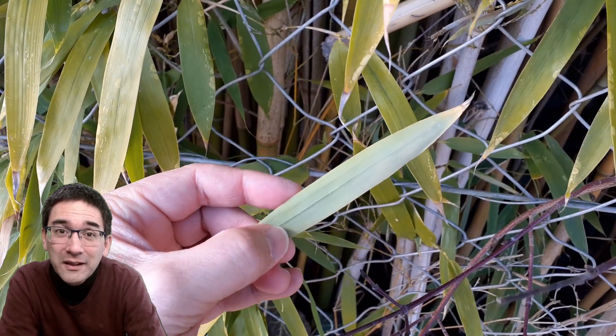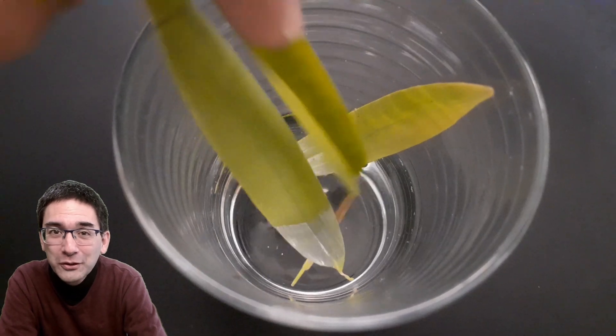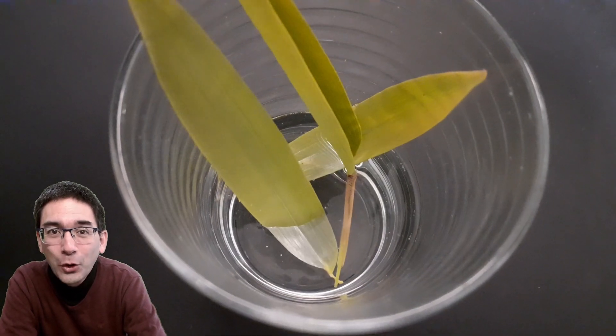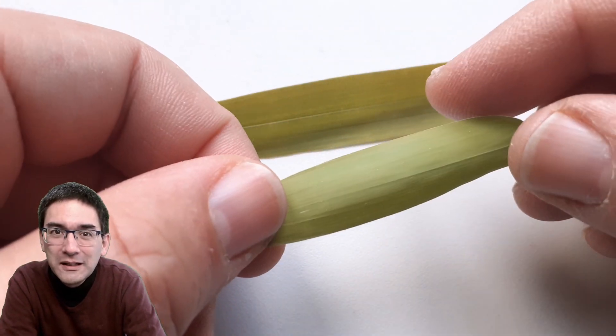The leaf is relatively thick — it's composed of several cell layers — and therefore I decided to experiment around it a little bit and to process the leaf in such a way that you can look at it under the microscope. I'm living in Central Europe so bamboo is not a very common plant here, but luckily I found a little bit of bamboo near the place where I live.